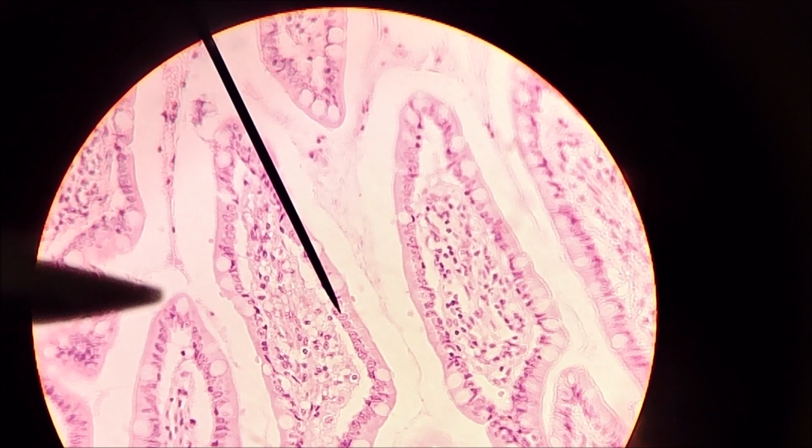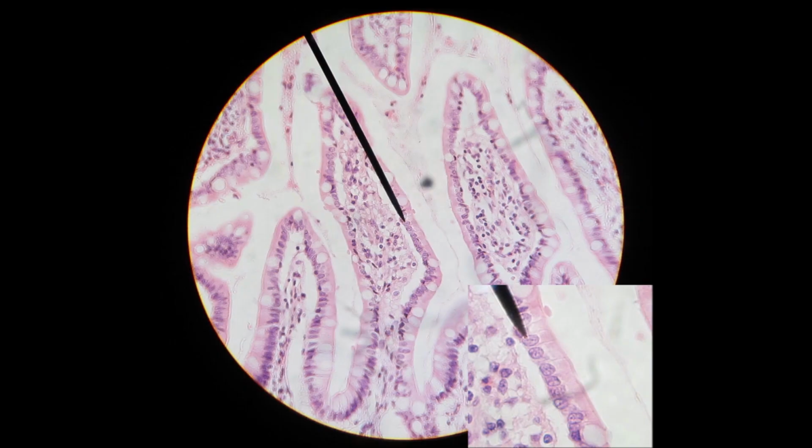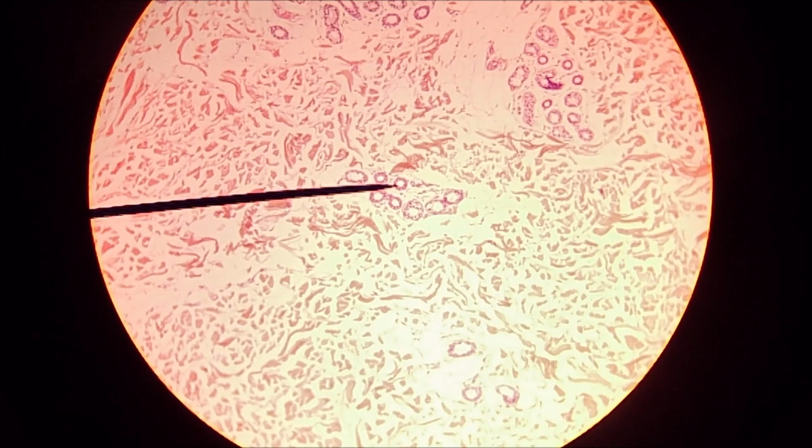And these are what produce mucus that lines the intestinal tract. So this is stratified cuboidal epithelium. What you see all up in here and all over there and all down in there, these are all parts of eccrine sweat glands in the skin.